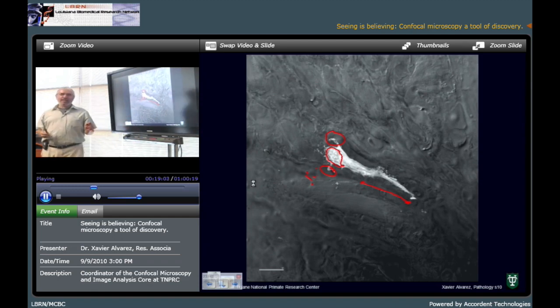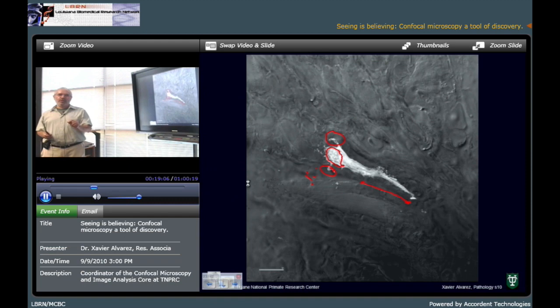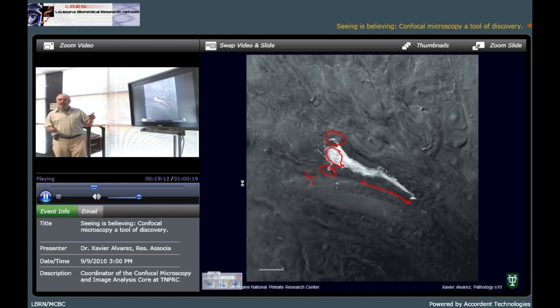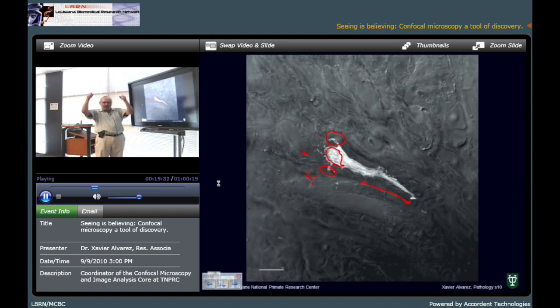I have a project where I study cell movement in the tissues, cell movement towards the infectious agent that we have. It's very easy when you see these kinds of pictures to say where the cells are going, because the biggest thing that they have inside is the nucleus. Then you could see that these guys are going to make the effort to bring something. They are pulling, okay? And this is without just trailing. That's the way that cells move in a tissue that is full of other things.